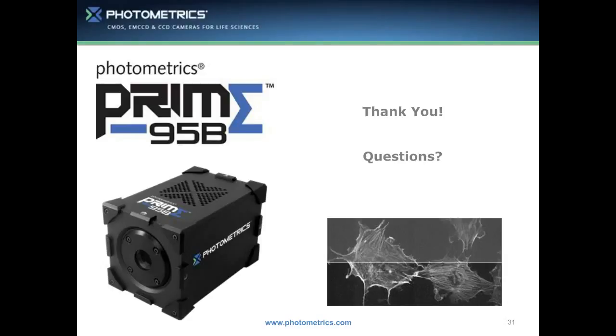Is the denoise algorithm free? So currently the denoising algorithm is available on one of the Photometrics cameras, the Photometrics Prime. There are publications out there that explain how the algorithm works, but to get access to the algorithm, you actually have to go to the Curie Institute in France and request a license to be able to get access to the algorithm.